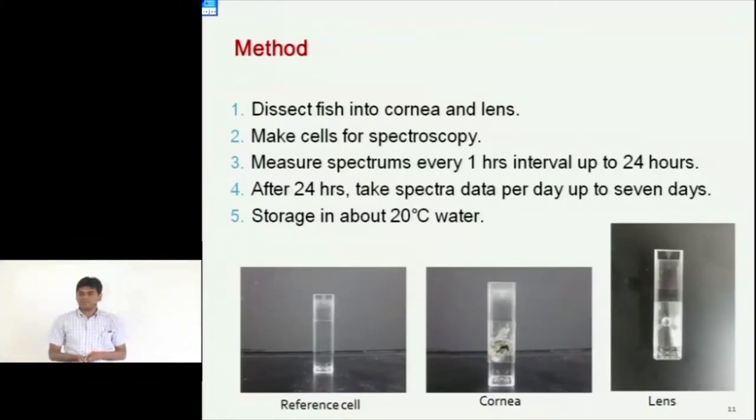We measure the spectra at 1 hour intervals up to 24 hours. After 24 hours, we take spectra per day up to 7 days. After every measurement, we keep this cell in an airtight polythene bag and keep it in 20 degrees Celsius water.